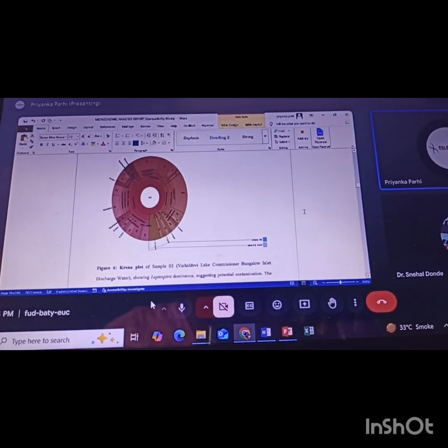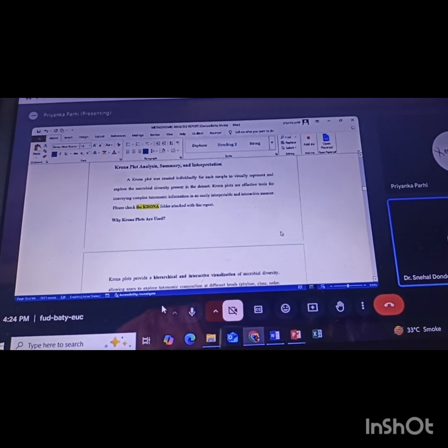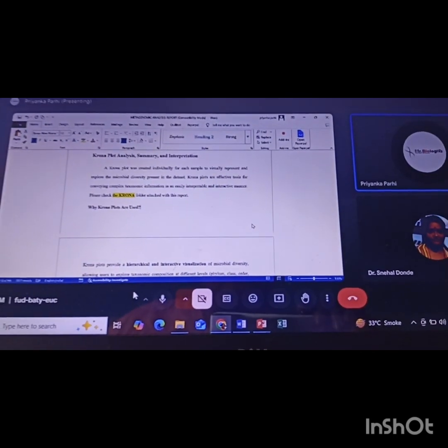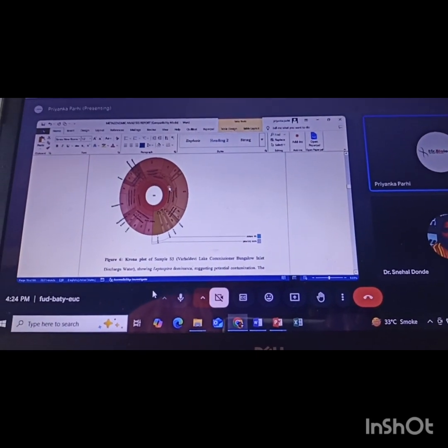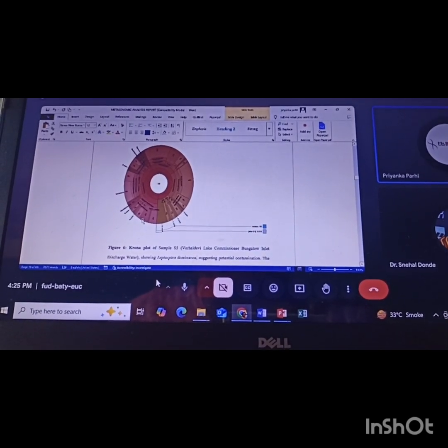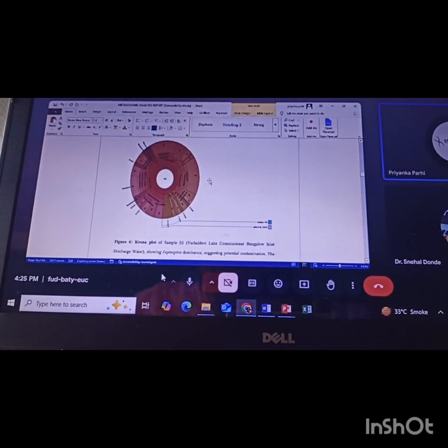I think I have written. Let me check. Go up so that we can make out. It's not. No, because in the Krona plot, species wise is very difficult to visualize. So no, actually this can be shown. Okay, see, bacteria, proteobacteria, or do you want me to zoom and name them? Which is the species, which is the genus? That might be much more useful. I don't think I can edit that, which is why I said at least one, if we can make it more detailed instead of all, that would give us a much better picture.